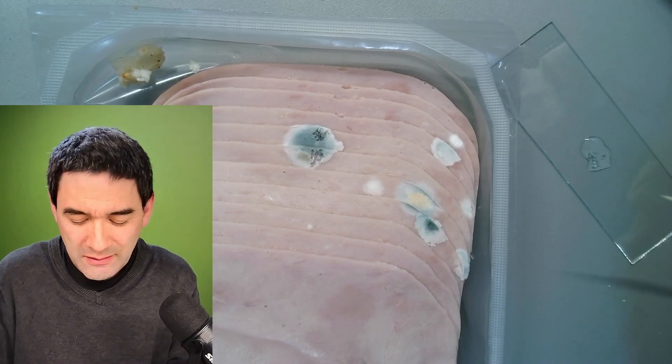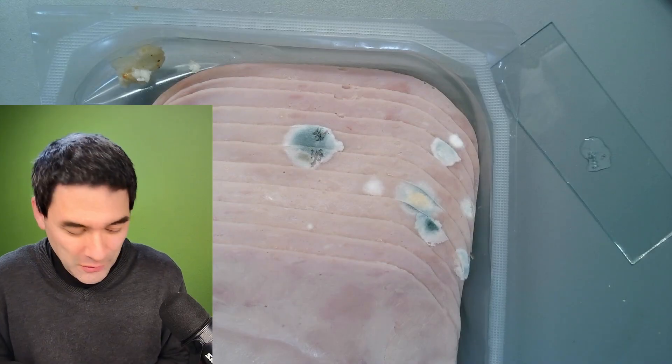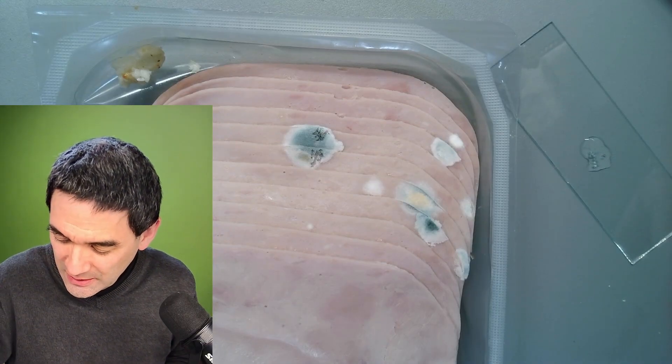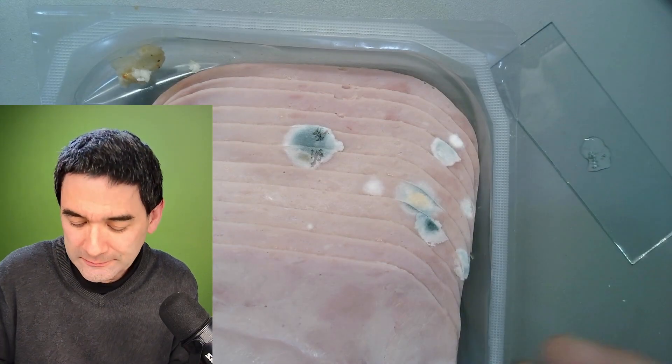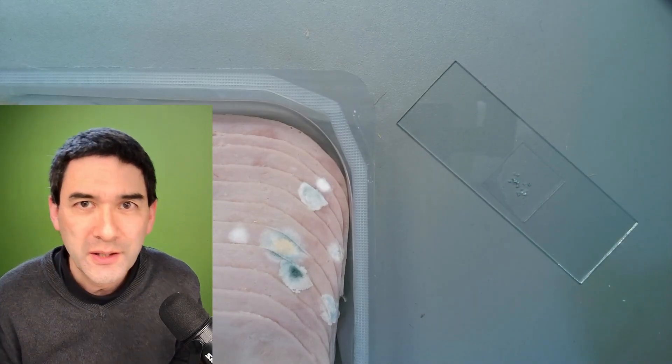I better dispose of it very quickly before I accidentally touch it. And of course, a cover glass goes on top. Here we go. Let's have a look under the microscope.